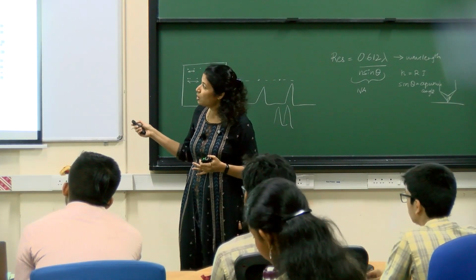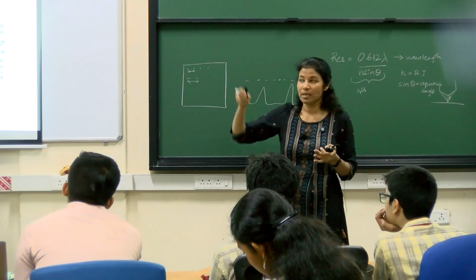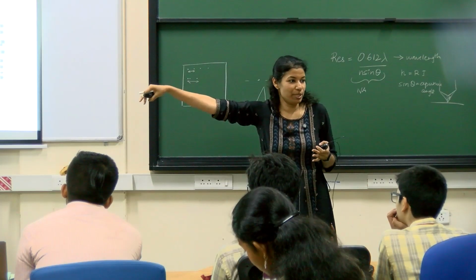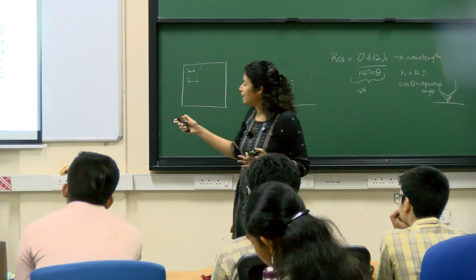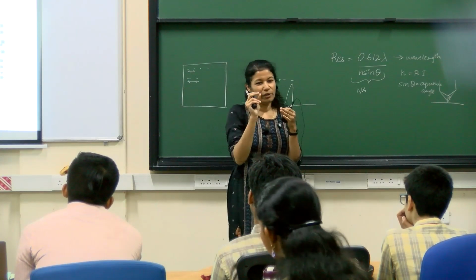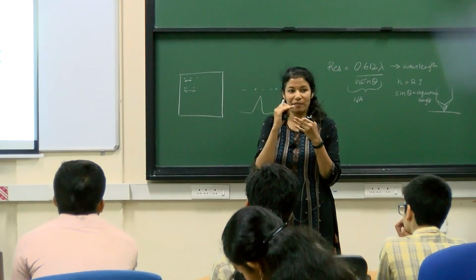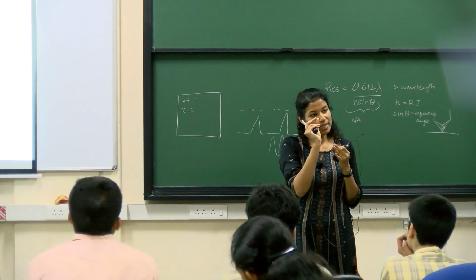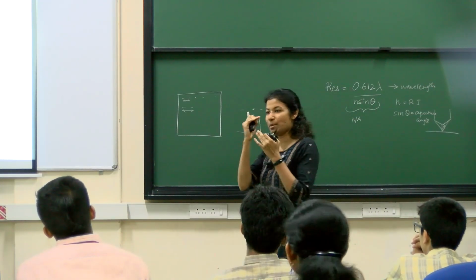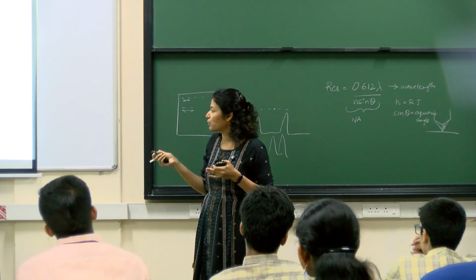Your source of electrons, or your beam of electrons, comes from the top, okay? It's on the top that it produces the electrons. And then you have your specimen, which is put on a very tiny support. It's not a slide. You don't have a slide over here. A very tiny support where you put in your sample. I actually have gotten that support. I'll show you all. It's a very tiny one, which you put inside the electron microscope.